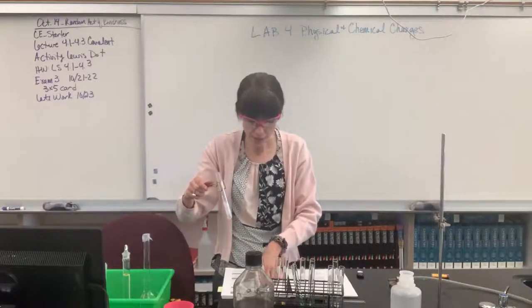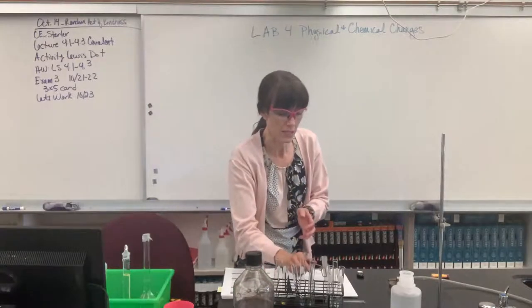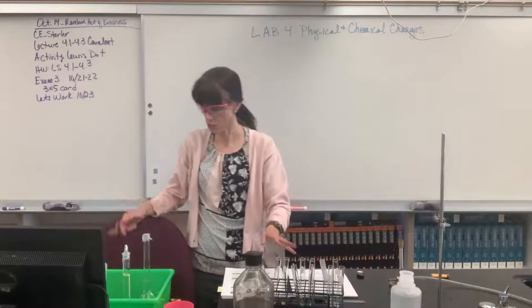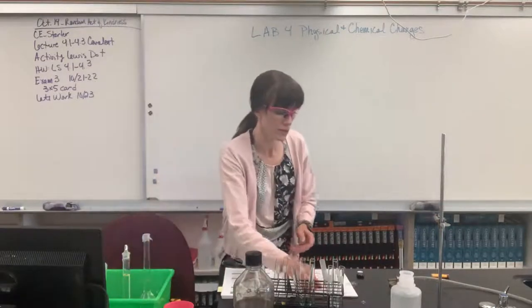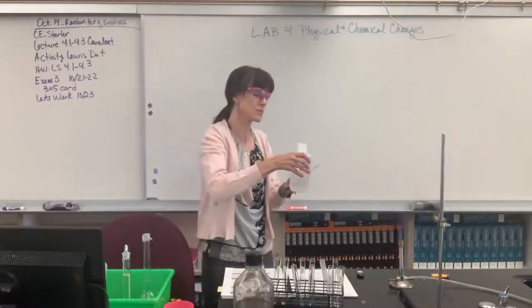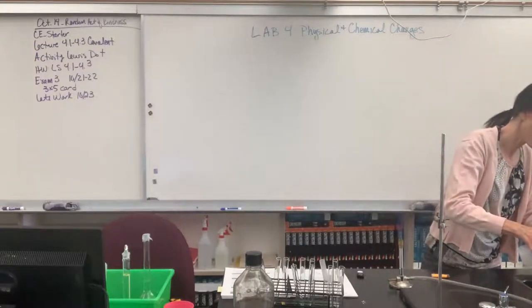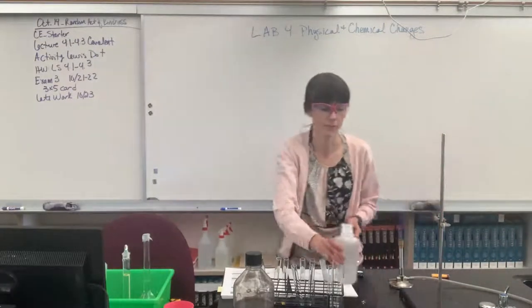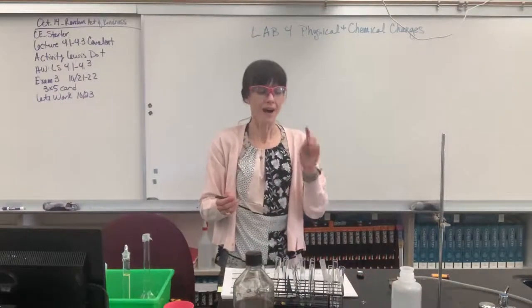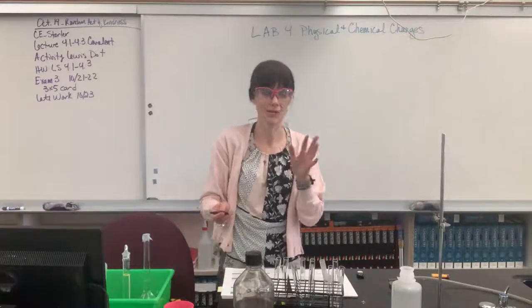It says, touch a small portion of the recovered solid in the flame using the stirring rod. So I'm gonna set this gently there we go, in my test tube rack. And I'm gonna go back to my stirring rod. I'm gonna rinse off my stirring rod first, just to make sure that I don't have any of the salt from the first trial. Okay, so that's rinsed off. Now, gotta be so careful. Hot glass looks the same as cold glass. That glass is definitely still hot, so I'm not going to touch it.